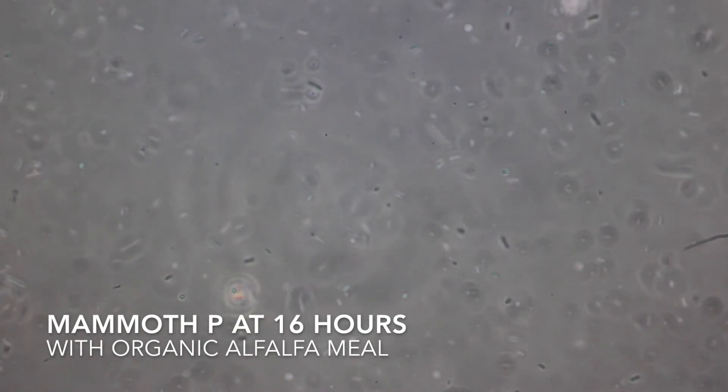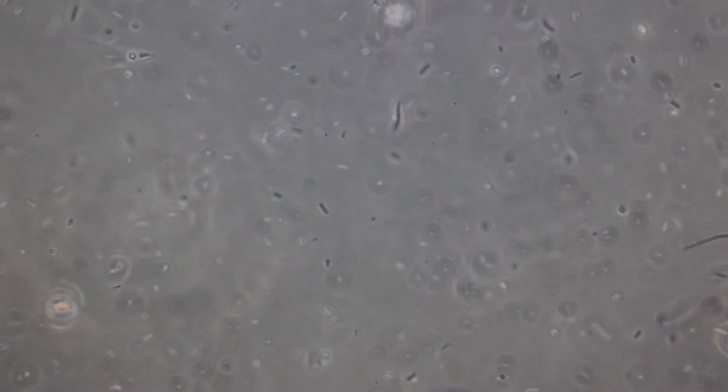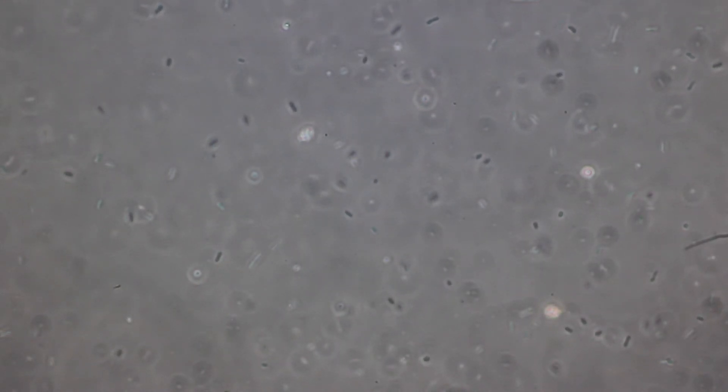Here's the alfalfa at 16 hours with the Mammoth P in distilled water. As you can see, there's pretty good bacterial growth — more than the control — and there appears to be a little more morphological diversity than we saw with the molasses, but not quite as much growth. I'm wondering if alfalfa is a better food source, especially considering they use alfalfa as part of their manufacturing process, or if I can increase the amount of microbe catalyst to get more bacterial growth while maintaining that diversity.